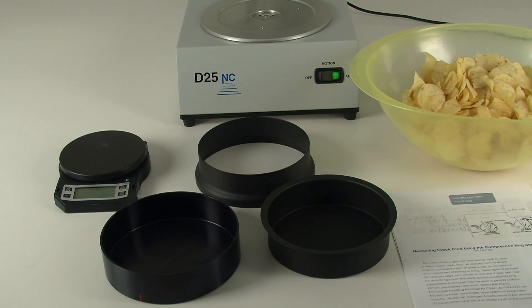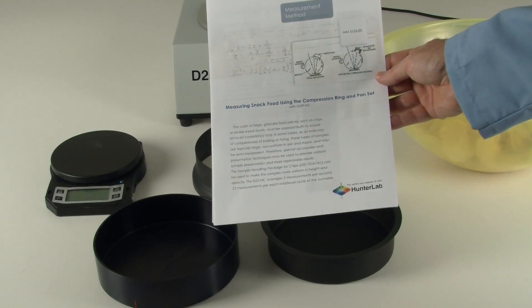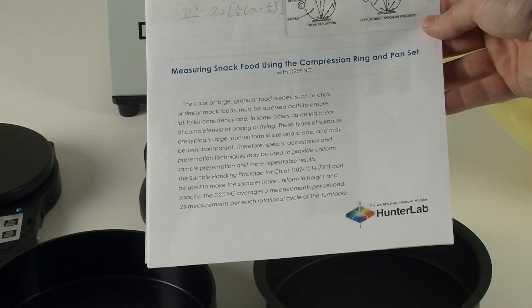This video demonstrates how to measure potato chips using the compression ring and pan set on the D25NC FM model. The measurement method used today can be found under the Hunter Lab website under the Knowledge Library, Measurement Methods.